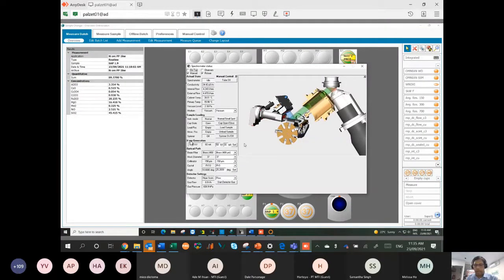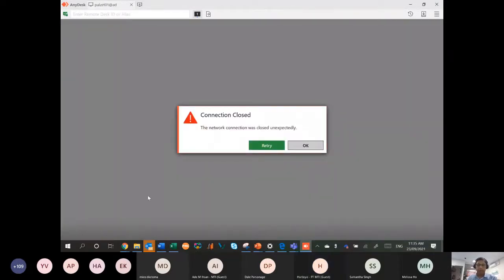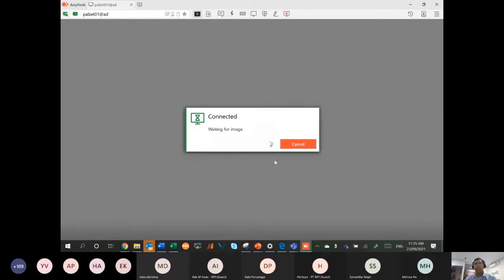Sorry, what was your second question? If you can repeat that. If there is any sample standard to check the stability of the machine. Okay. It doesn't have to be a very specific sample. If you want us to supply, we can supply some monitor samples. But all you need is some sort of QC sample, which should be a fused bead or at least a stable monitor type sample. Run the sample, say about 10 times, and then look at the standard deviation of the measurement.